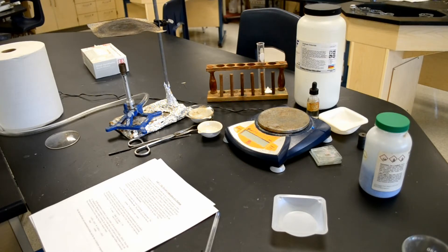The percent of water in a hydrate can be found experimentally by accurately determining the mass of the hydrate and the mass of the anhydrous salt after heating. The difference between these two masses is the mass of the water that was evaporated. The percentage of water can be calculated by the following formula. Percent of water is equal to the mass of water divided by the mass of the hydrate times 100.